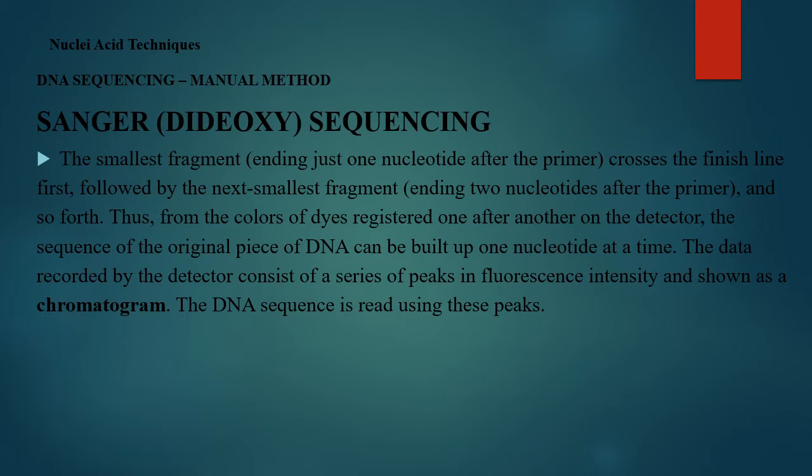Now, if my primer is 4 nucleotides, so ADOM is the primer. When I go through this Sanger dideoxy sequencing process, I'll produce a chain which is 5 letters. So ADOM is 4, and the 5th letter in Adomako is A, so my next fragment will be ADOMA.